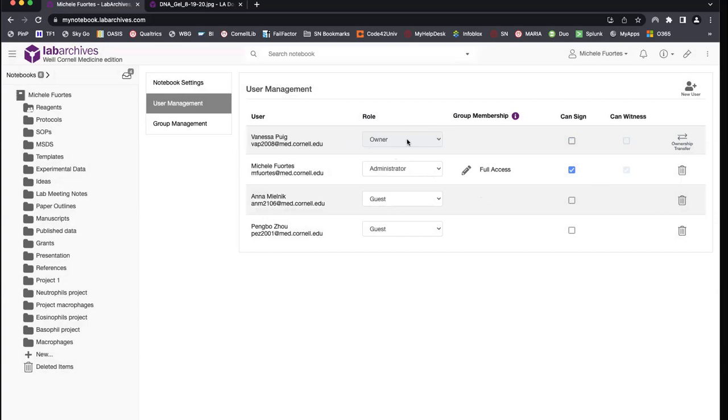And so even if I leave, Vanessa still has access to the notebook and to everything I've done. And I'm still the administrator because I created it, so I can basically do everything. But Vanessa is still the owner.